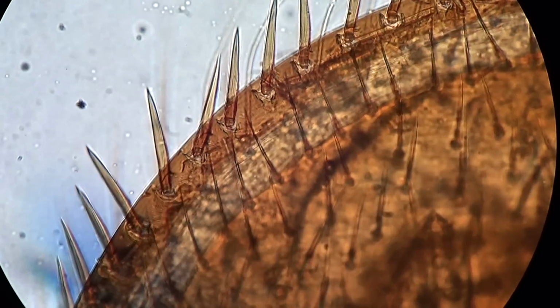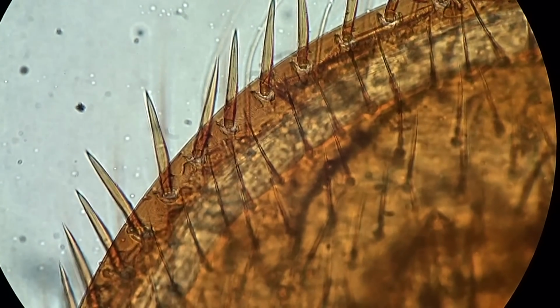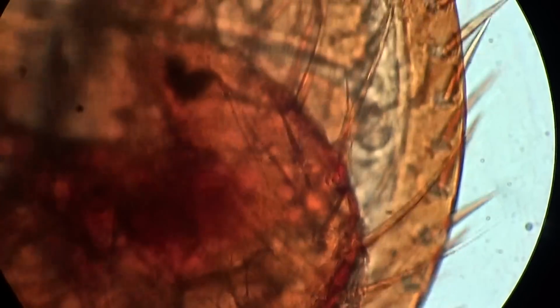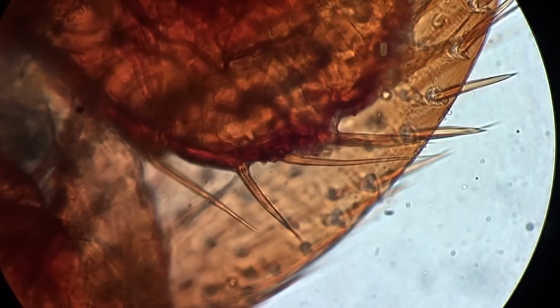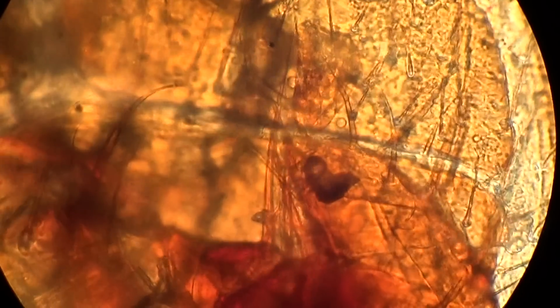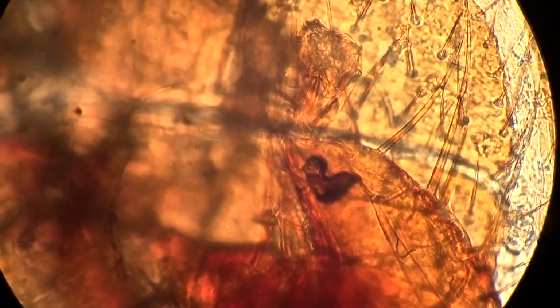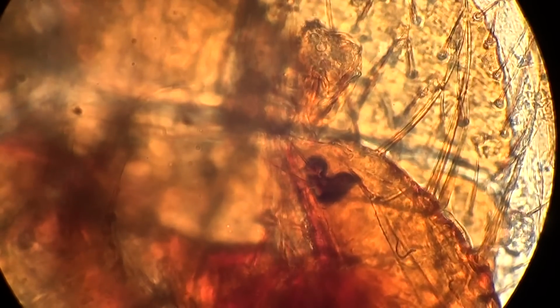So strong setation is a special feature of Varroa mites, on the whole of its body and also just on the edge. You can see these very special sensilla and seta. And again you can see this triangle-shaped pulvilla in the center or just near the upper side of the frame.